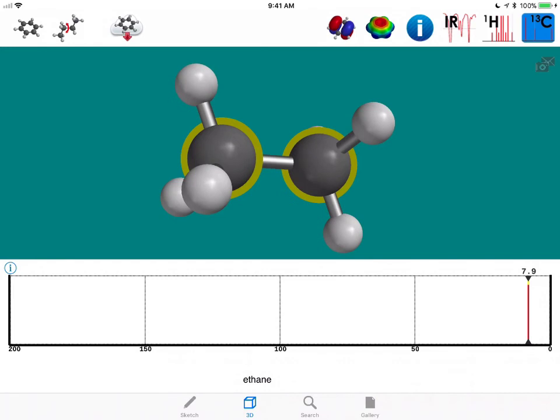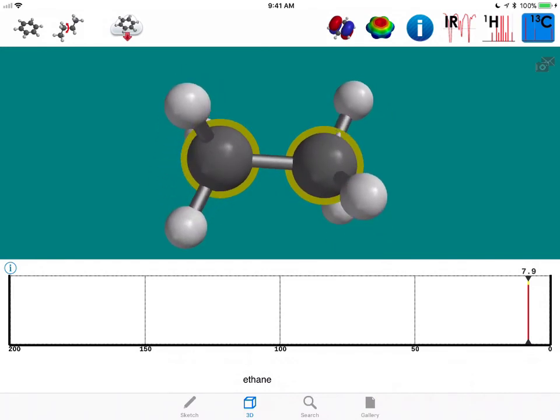In the carbon NMR, as you can see, there's only one unique type of carbon, and that occurs at 7.9 parts per million in the simulated spectrum.